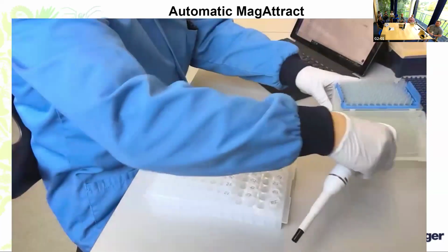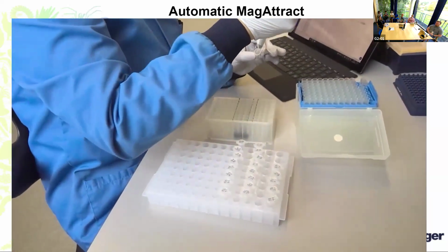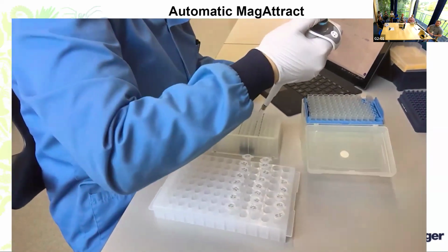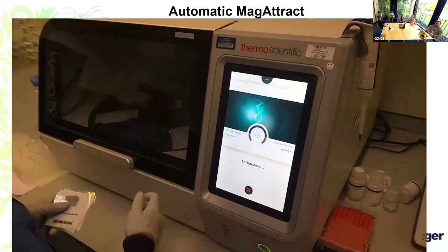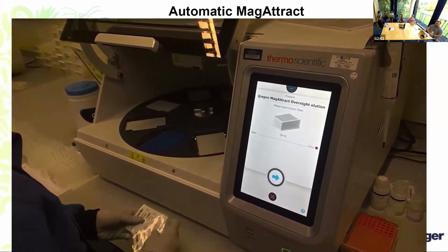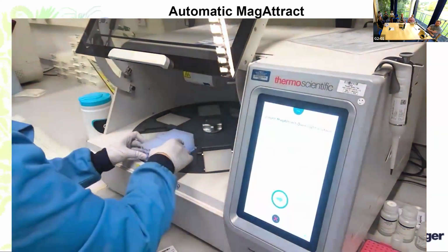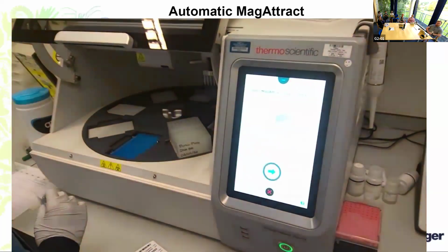At the moment, we can only load one sample at a time into each well of the plate. What is also important is that we use wide bore tips when working with DNA, so that we don't have any shearing during the transfer of sample into the plate. And so here we are just loading our Kingfisher plates into the Kingfisher.